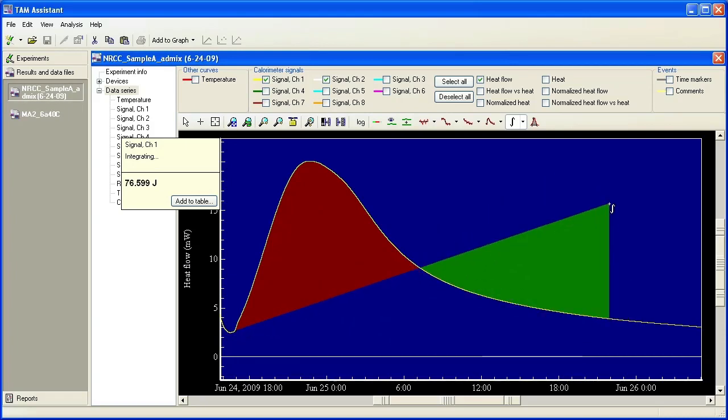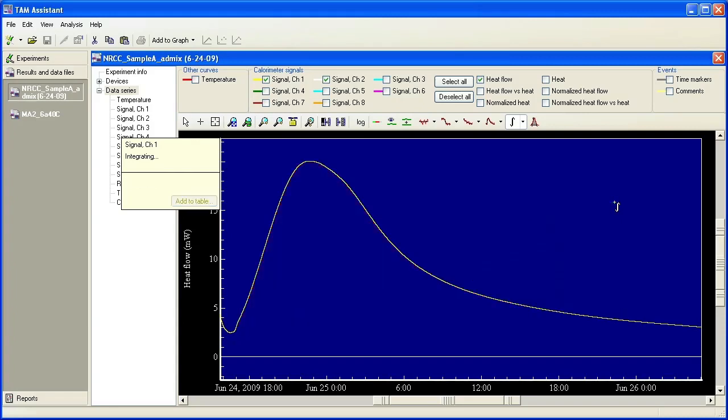You can see here that the red indicates exothermic as positive above the baseline of integration and green indicates endothermic or negative below the baseline of integration. If I release the mouse, you see the integration goes away.